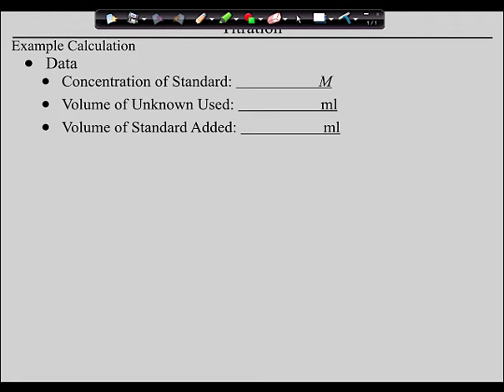Guys, these are stupid expensive, $52 each. I just had to buy a dozen of them. That was more than $600.